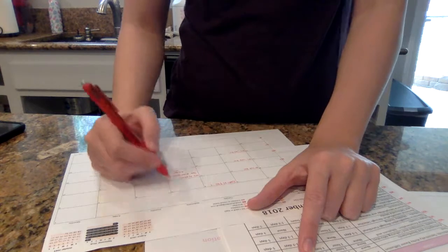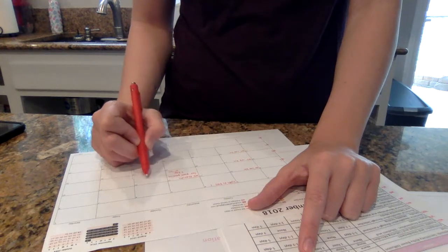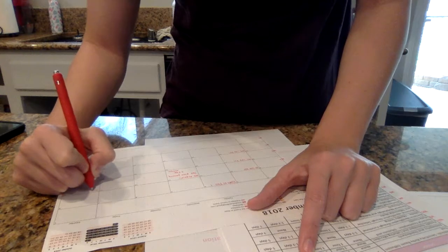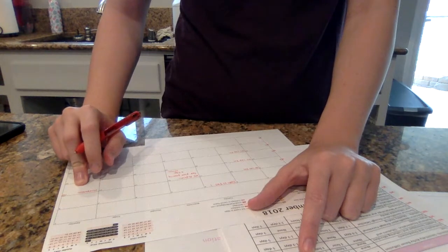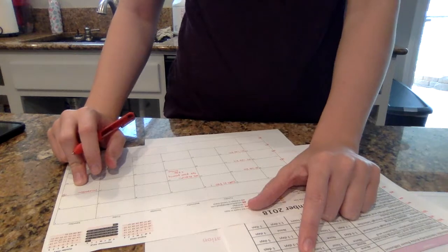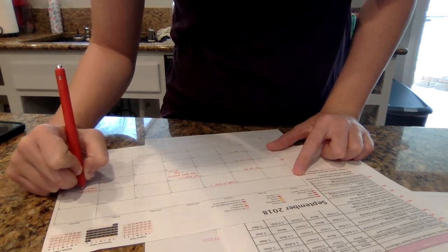So I will start on Wednesday, and I'm going to go ahead and count over 3 days, just to give myself that time frame. So we'll go 1, 2, and 3. And by Saturday, I'm going to be checking on the status of that plate pouring. This experiment takes a total of 3 days. We're going to go aseptic.